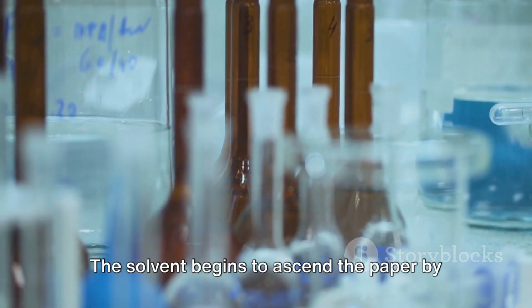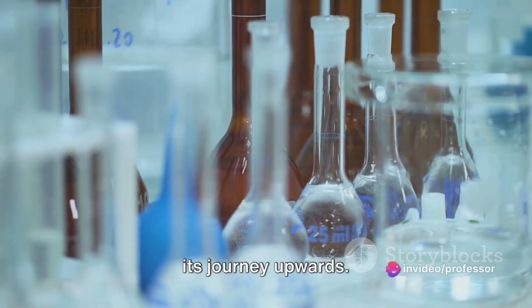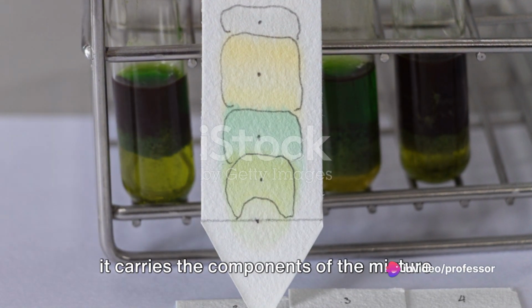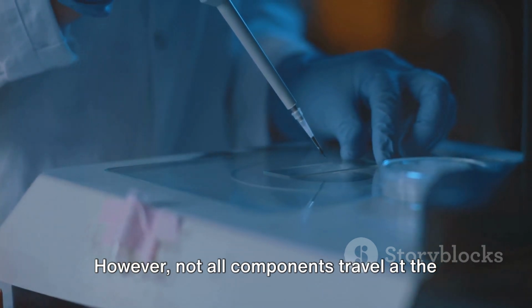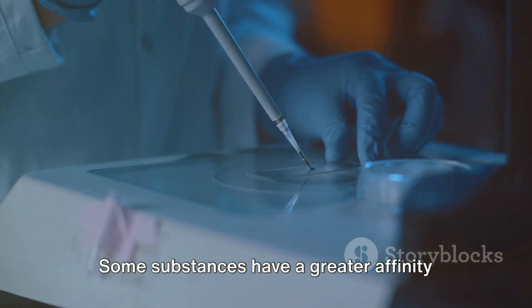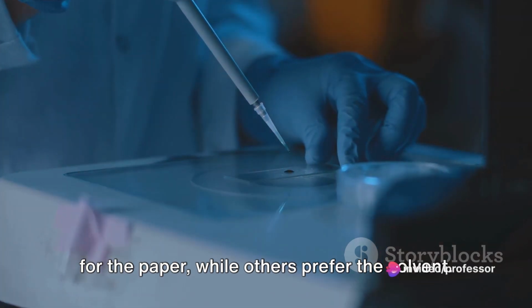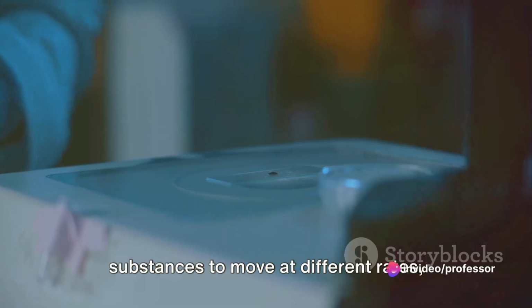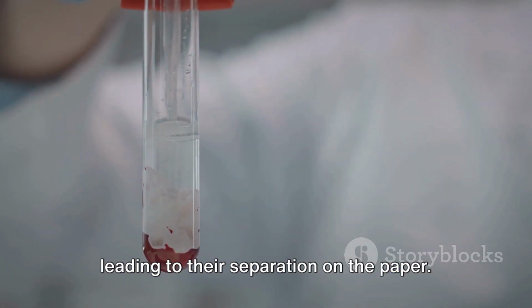The solvent begins to ascend the paper by capillary action, meeting the sample on its journey upwards. As the liquid phase moves up the paper, it carries the components of the mixture with it. However, not all components travel at the same speed. Some substances have a greater affinity for the paper, while others prefer the solvent. This difference in attraction causes the substances to move at different rates, leading to their separation on the paper.